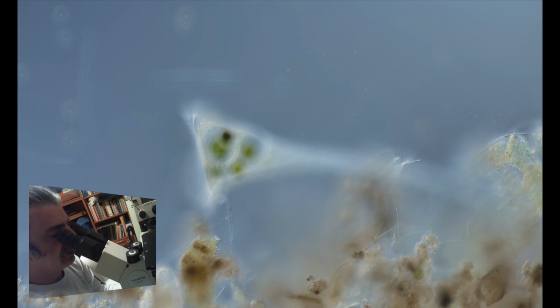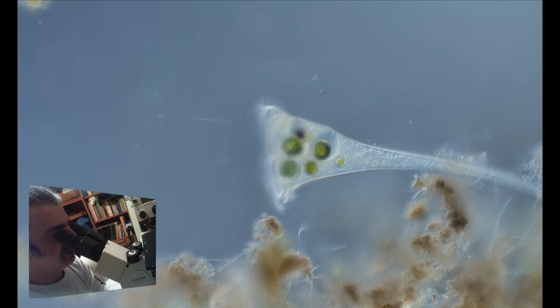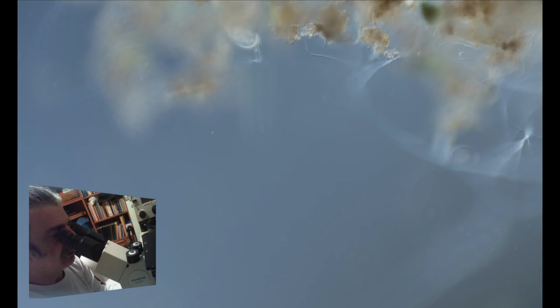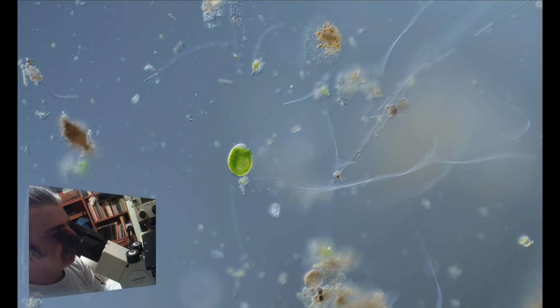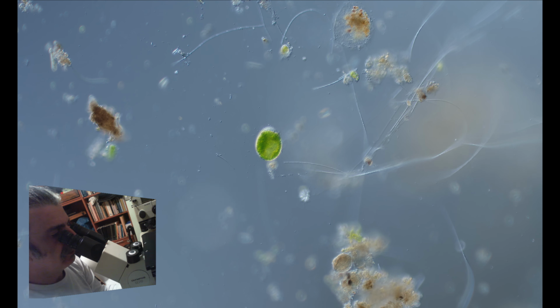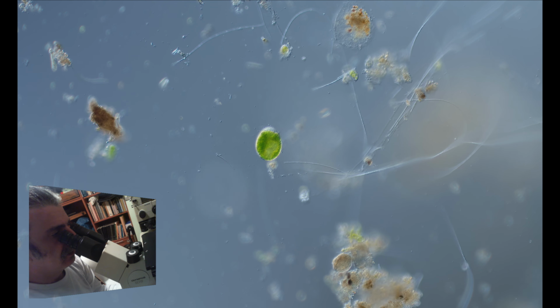Downside of using a petri dish, the water column is not even, so creatures can go up and down. Stentor, you can see how it sucks particles into its mouth. This one is, I think, a zoospore of an algae.